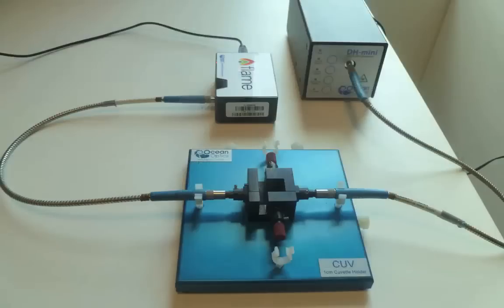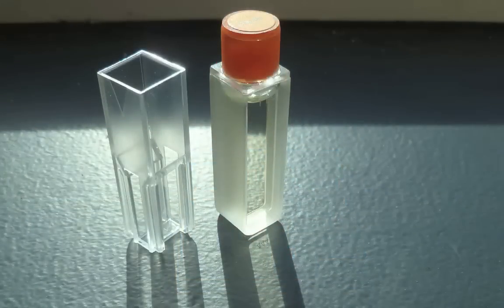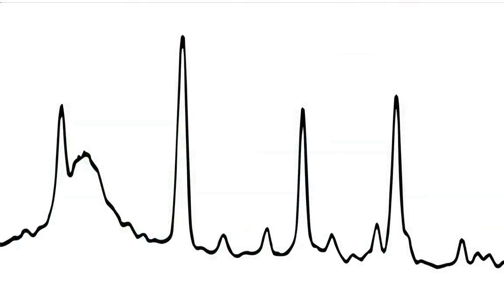For this demonstration we will look at the absorbance of a Holmium Oxide Starner Scientific absorbance standard. This absorbs in the UV and visible ranges in sharp, recognizable peaks.